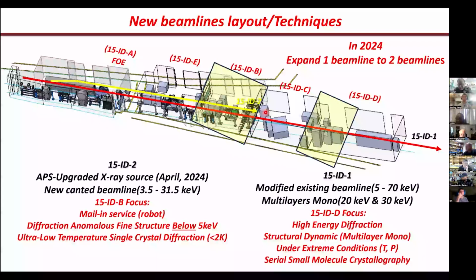And is the high pressure work done at low temperatures as well? Good question. Yes, I think they are working on the low temperature cell, and I don't know about the opening angle. They are pretty much working on it for powder. I don't think they are working on single crystal. I have to double check.